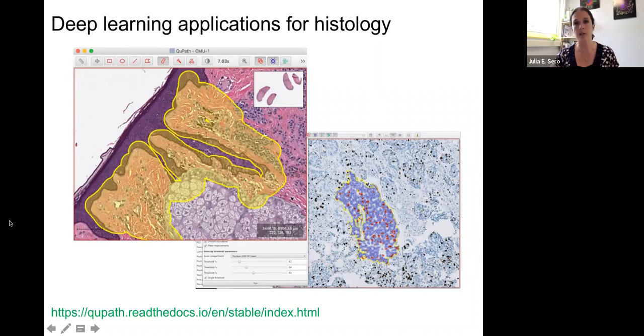It's also running deep learning under the hood, and it's a user-annotated type of system where the user would say, okay, this is a kidney tubule, what have you. And these dark spots are cells which are positive for a proliferation marker, or here is a complex tissue and there are different things in amongst it.